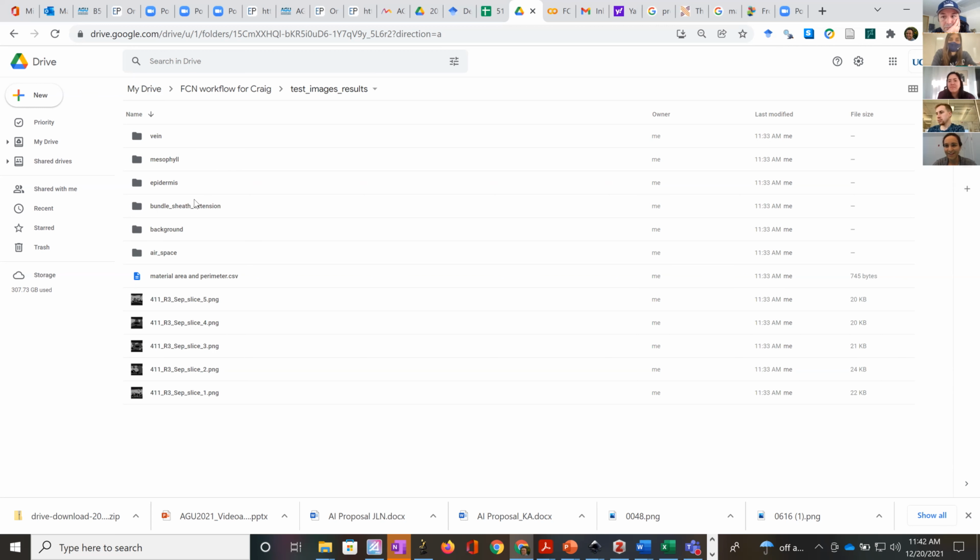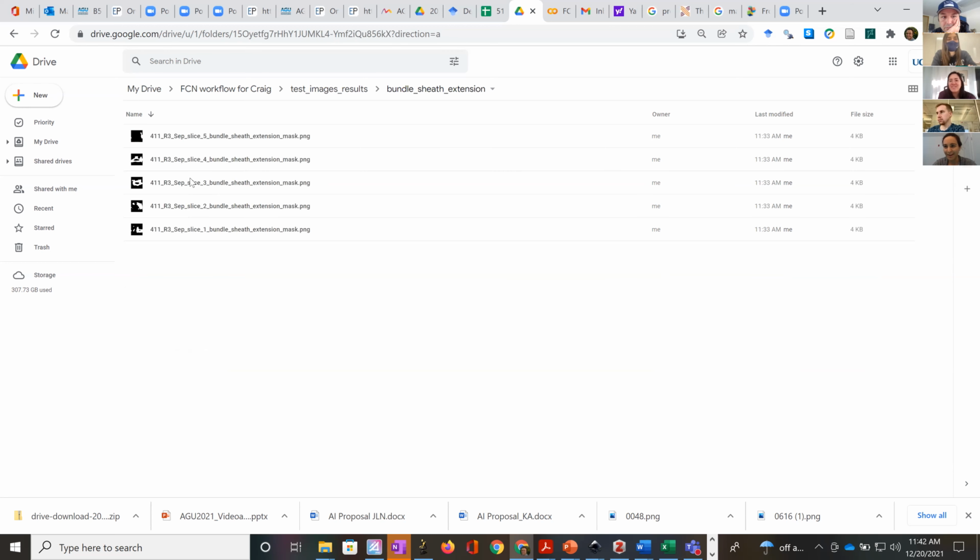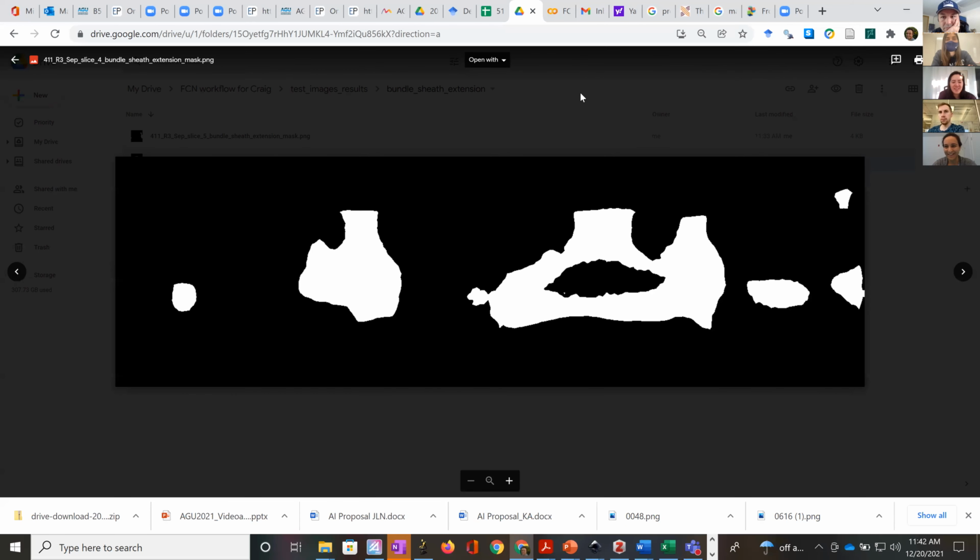Is there any other? I think these are the general ones we were getting from random forest. Yeah. Volumetric related and tortuosity. Yeah, that's great. Yeah. Thanks.